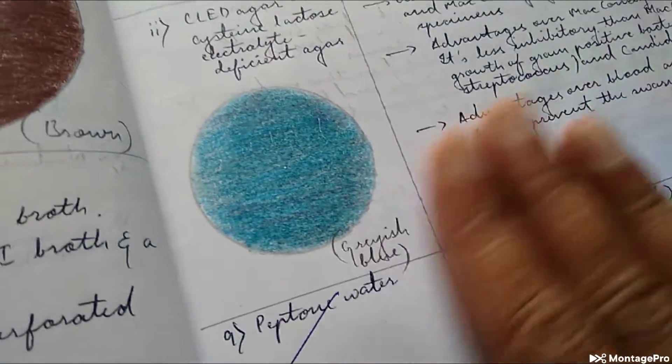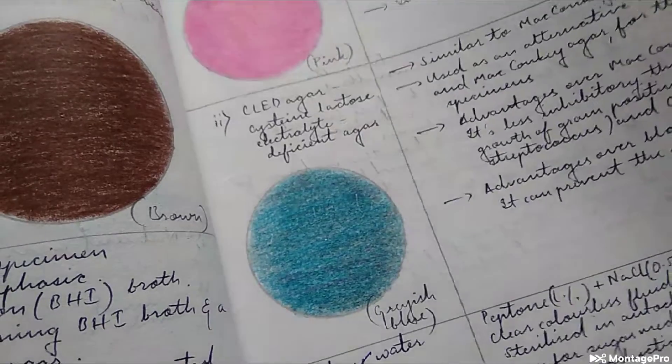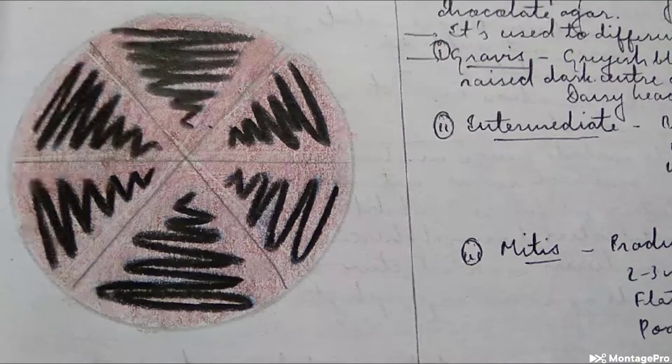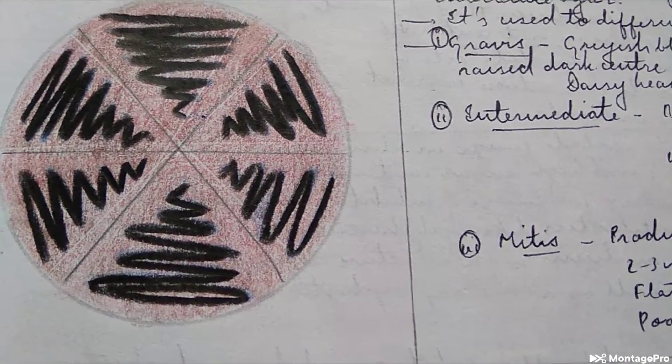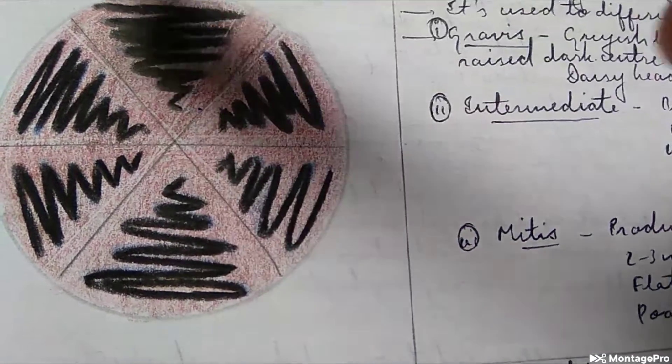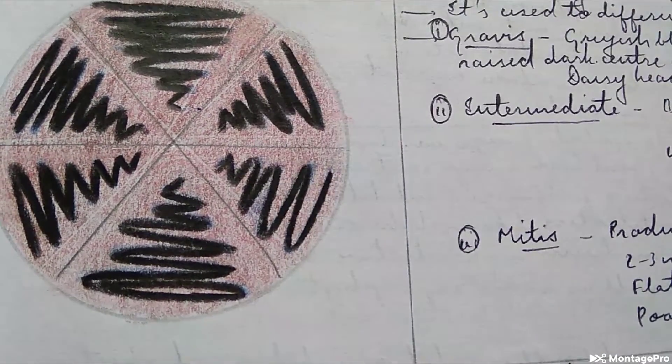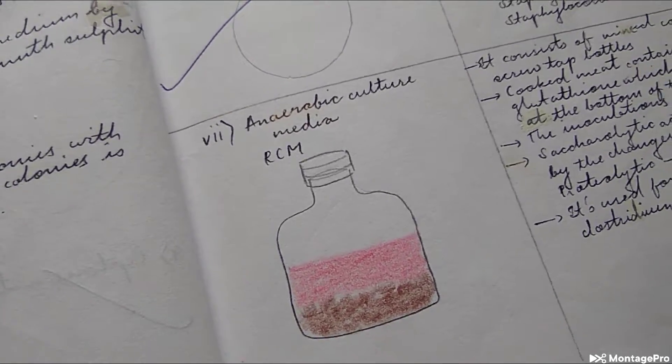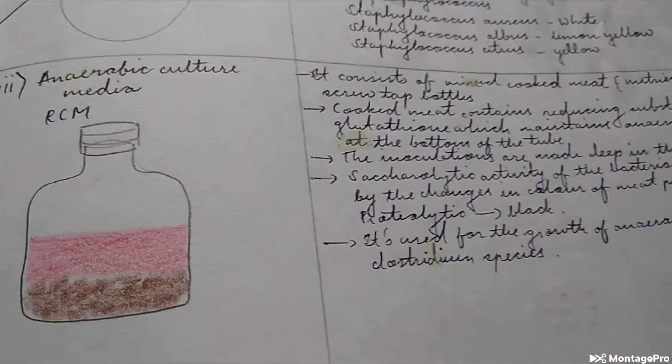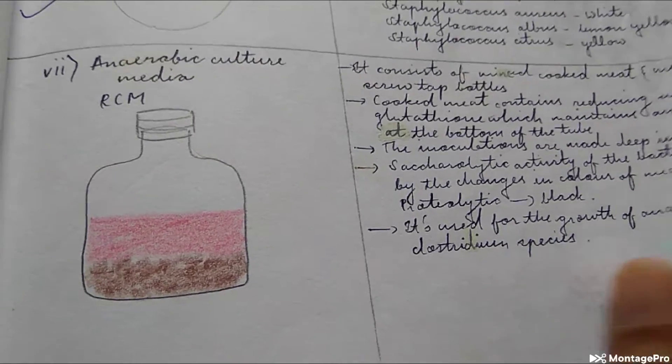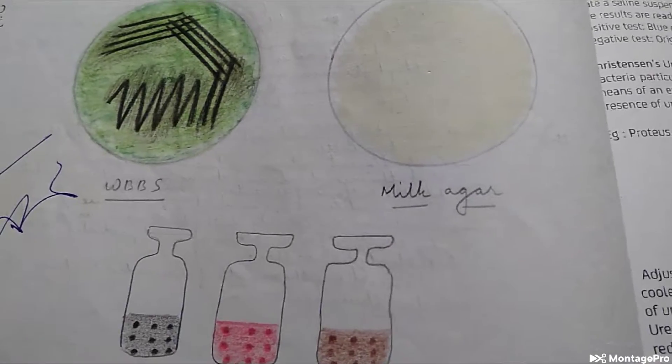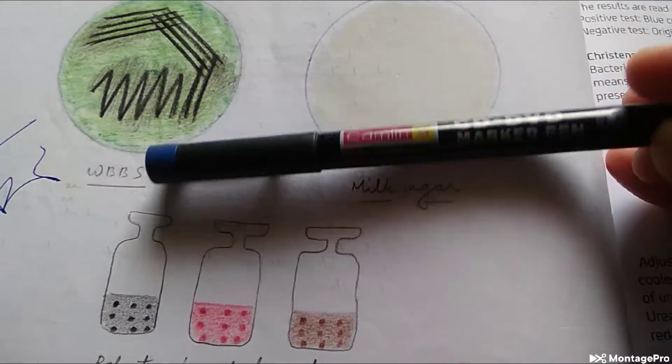This is your actual blood agar and then this is pink. We don't use such a pink MacConkey. Blue CLED agar - cysteine lactose electrolyte deficient agar. This is the potassium tellurite medium. What is this? This is anaerobic RCM broth, cooked meat, Robertson cooked meat broth. Yellow milk agar, light yellow kind of. What is this? Wilson Blair media.